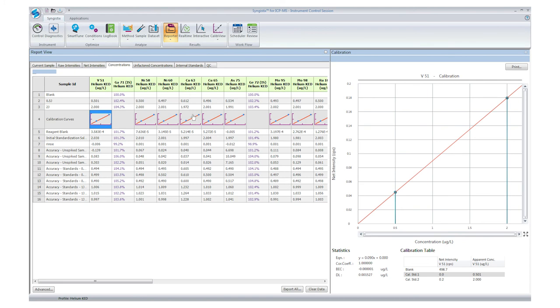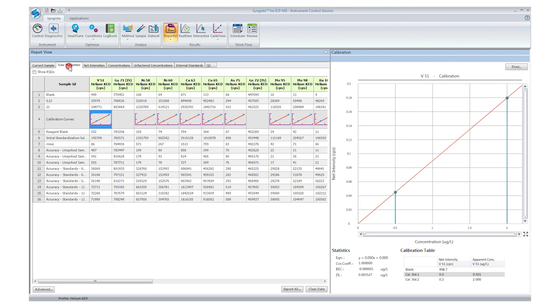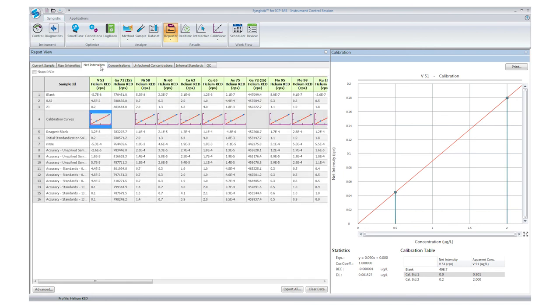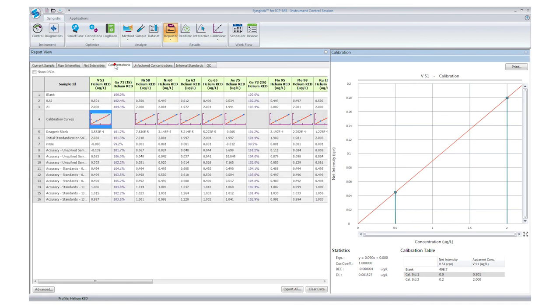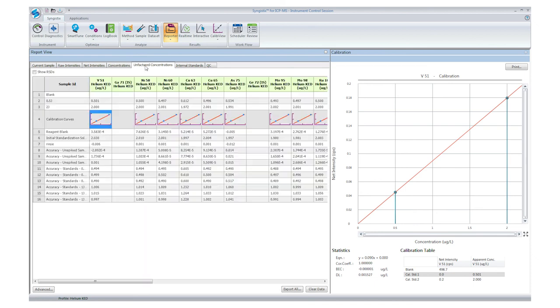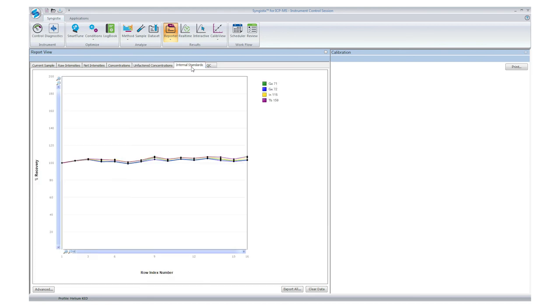In the reporter screen, you can see raw intensities, net intensities, concentrations, unfactored concentrations, and very importantly, a chart that shows how your internal standard behaved during the run.